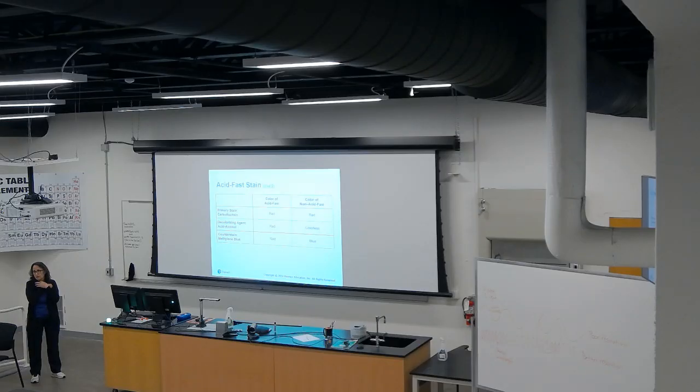and sometimes, if you use this technique, you can use these reagents to stain, for instance, Mycobacterium, but you can end up with gram-positive or gram-negative looking Mycobacterium. When you have this, you call it gram-variable. But you don't want this gram-variable result. You want to either have gram-positive or gram-negative. Well, in this case, you use a different technique.